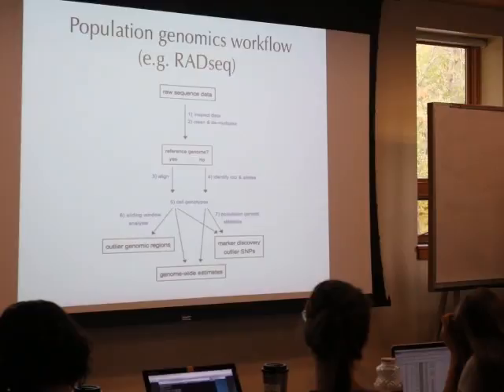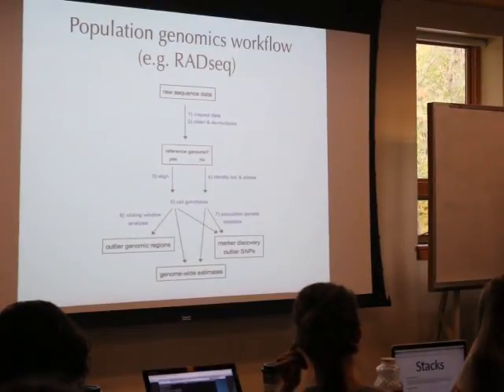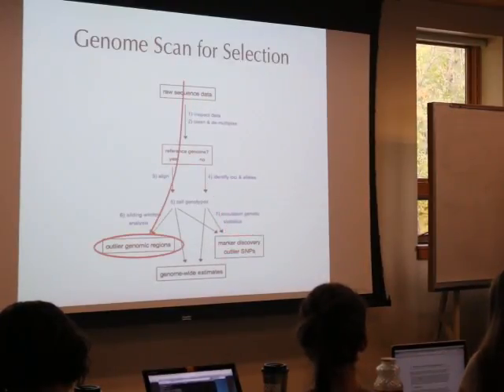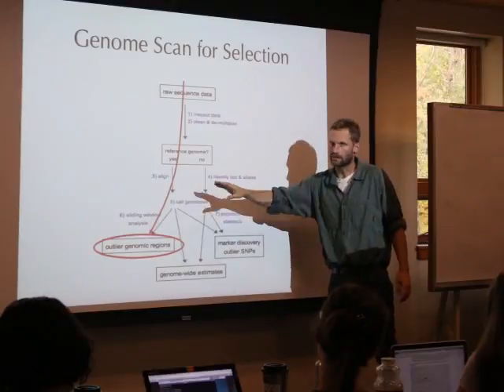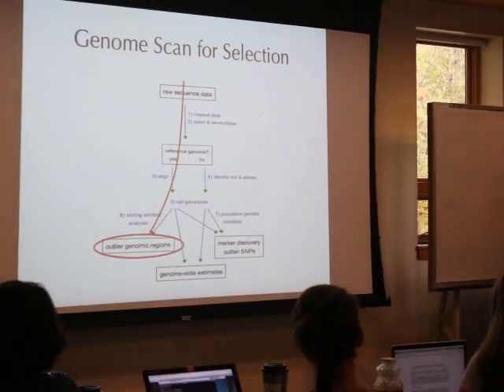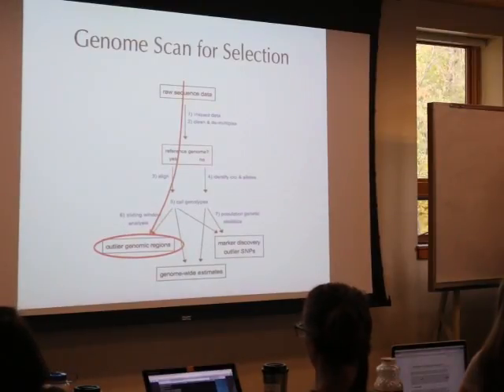And so this is basically a different version of what's in the handout. You can imagine different paths through this workflow where you're combining different steps. And this is where Stacks gets its model, in that Stacks has all these different modules that you can combine in different ways to get different workflows depending on your situation.